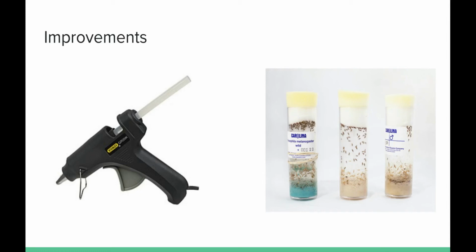Improvements that can be made for our experiment are relatively brief, however, they could improve our data. First, a perfect seal at the entrance of the maze could be made because a few flies were able to escape through small gaps at the beginnings of our trials. We could have done this by not having removable entrances and exits, or by sealing the joints carefully before every trial. Additionally, the flies could be allowed more time to reproduce in order to obtain a larger sample population. While our experiment was successful, it would be more reliable if a larger sample size was used.